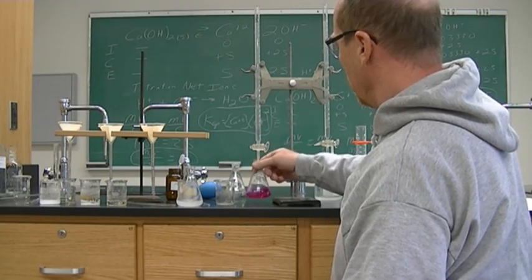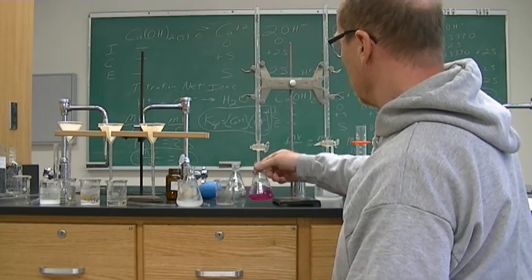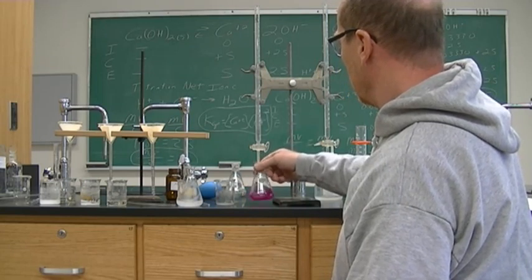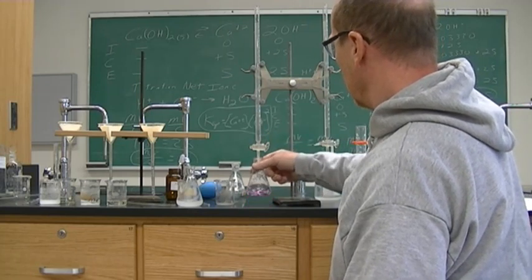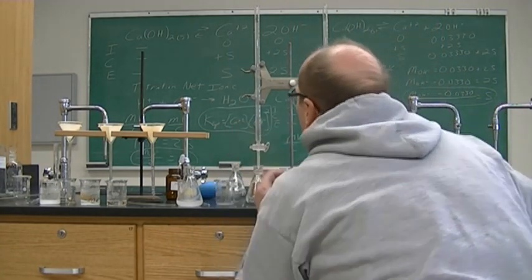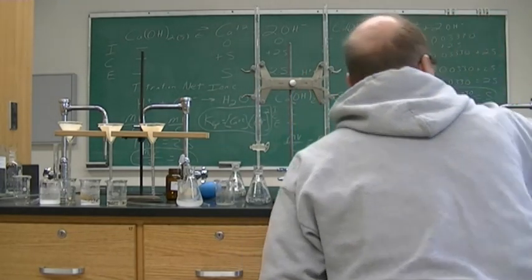Getting a little bit lighter. It's getting closer to the end. There we go. So 1 drop, change it. All right, and we are at 22.12 mLs.